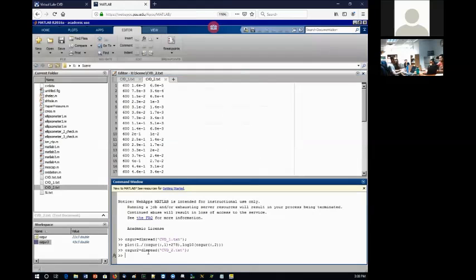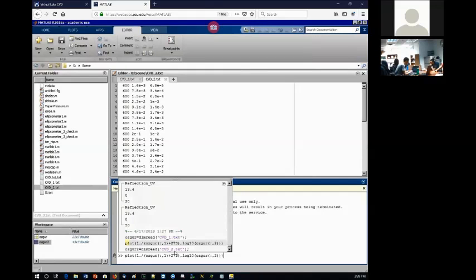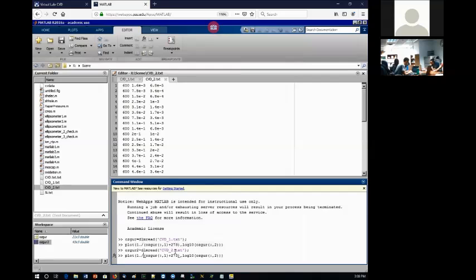So the units are okay. So what I'm going to do is hit plot again, click PL, and then hit up arrow. It will bring the same thing from memory.